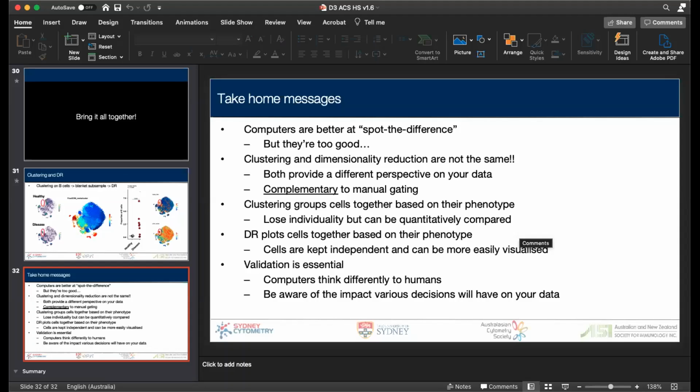I think something that's worth keeping in mind for how these processes work is that the clustering algorithm may group cells into groups, but the way that the dimensionality reduction algorithm sees it might be different to how the clustering algorithm does it. One of the reasons is that typically with something like t-SNE or UMAP, we're only rendering it in 2 dimensions. It might see, say, activated cells and non-activated cells in one cluster, but on the plot, it sees that difference more strongly than the clustering does.